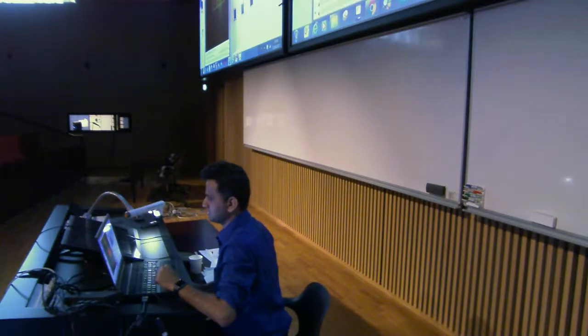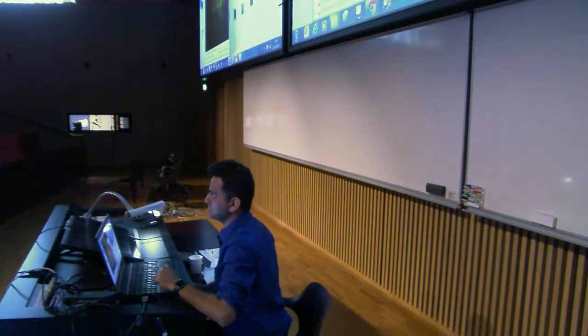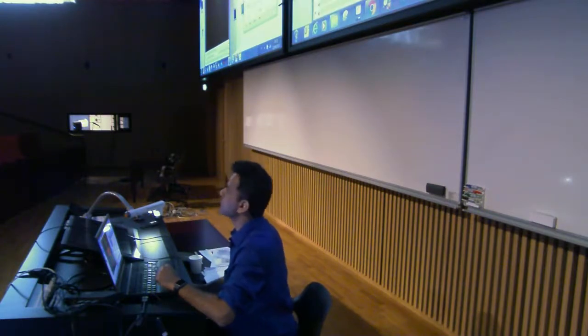Just go to image, stacks, and then plot z-axis profile, and it is asking me for time. Go to live, and then you can change it actually, and it's live. It would tell me the mean intensity over time and also this thing.